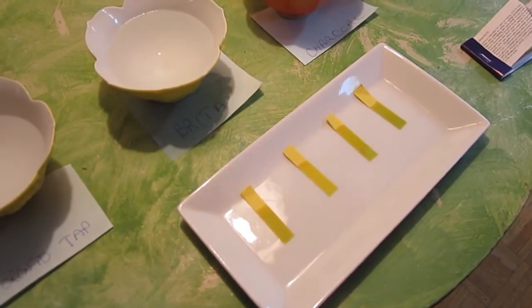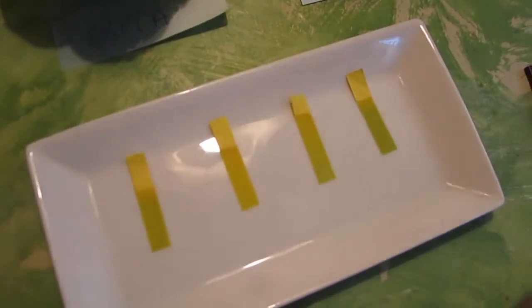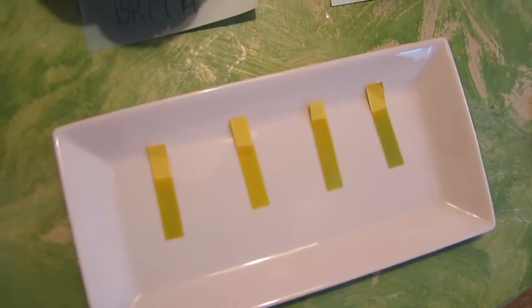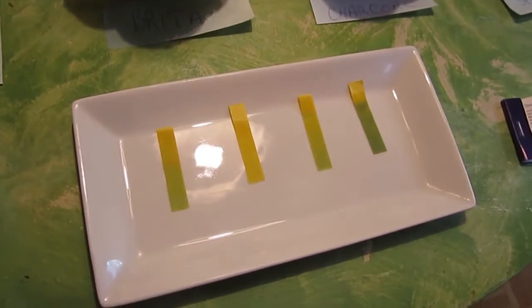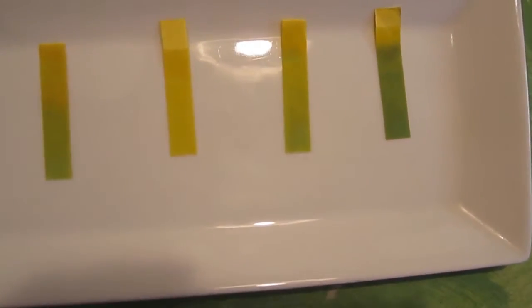And we'll just wait and see what happens. Okay, so it looks like the spring water north of Toronto is really a neutral pH.